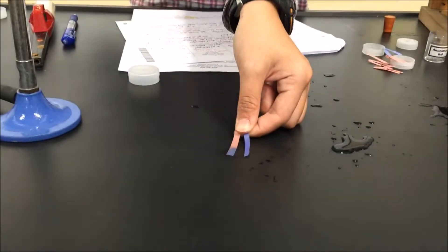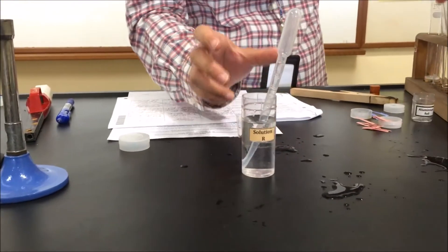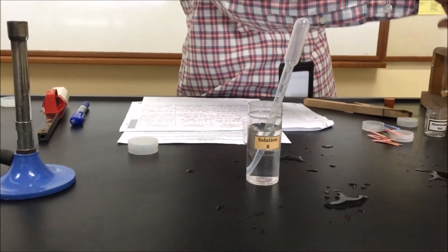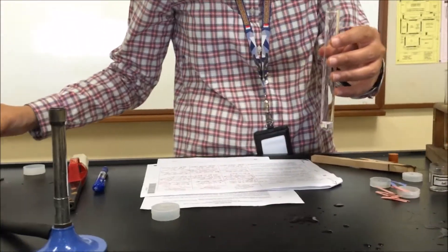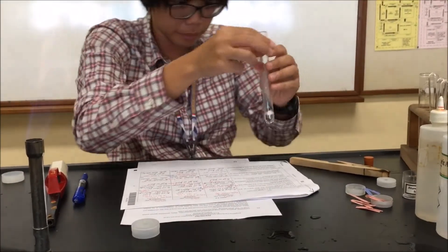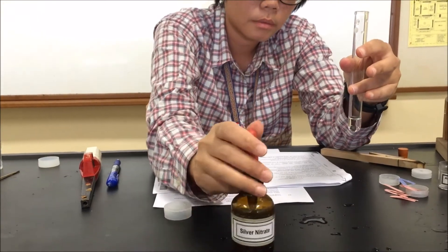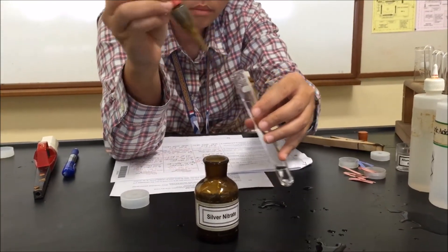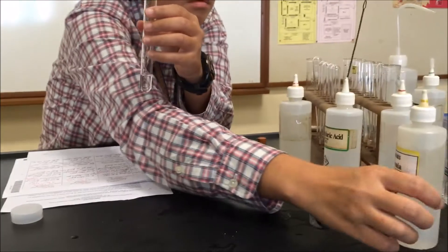Next we go on to Part C for Solution R: one cubic centimeter of R in a test tube, then one cubic centimeter of dilute nitric acid — always shake and mix. Then one cubic centimeter of silver nitrate. The observation is that a colorless solution remains. We add excess ammonia and a colorless solution remains.